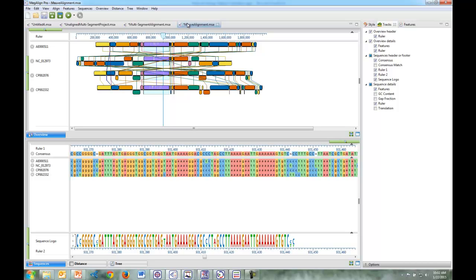Now, these blocks represent multiply aligned sections of at least two of the current set of genomic sequences. So discontinuity in the numbering is displayed as a break between the different blocks. And some of these connecting lines that you see here also show the correspondence between blocks. If you notice any of the blocks hanging below the black line, as we see with this green block here, this indicates that the hanging blocks are on the opposite strand compared to the other blocks.